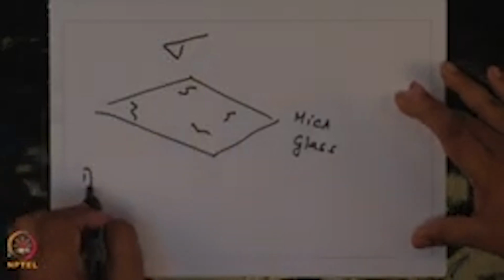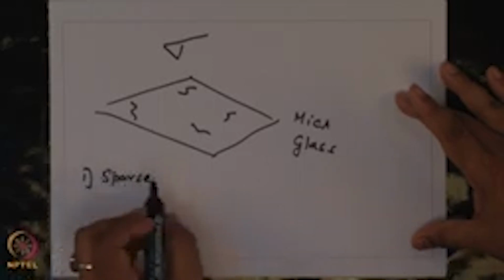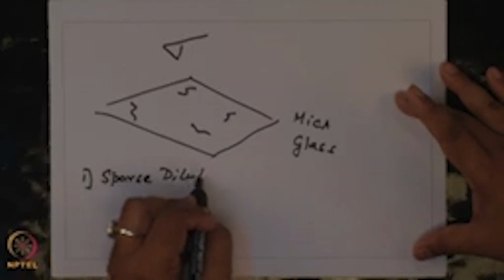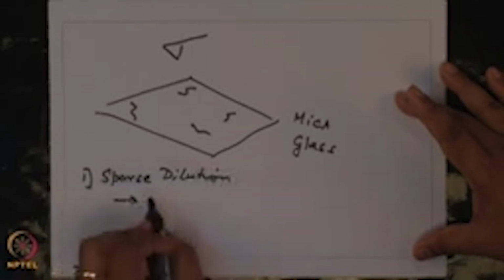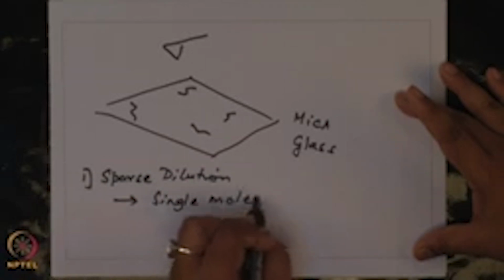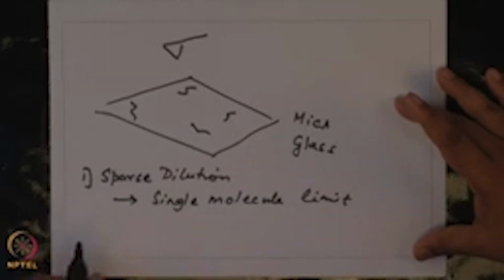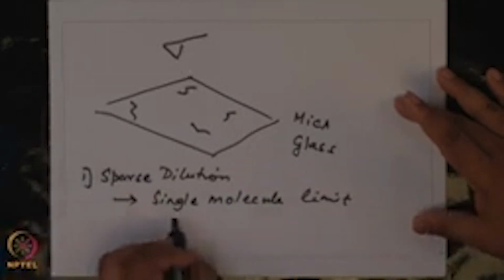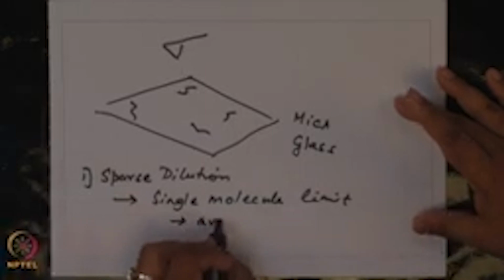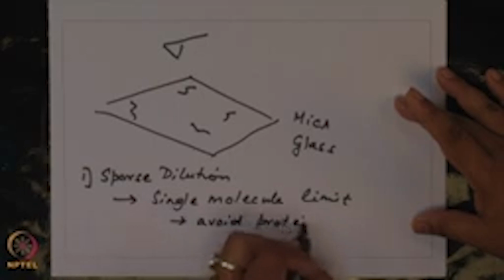One thing to note is you want to operate at sparse dilution, or rather almost at the single molecule limit, so that you can avoid protein aggregation.